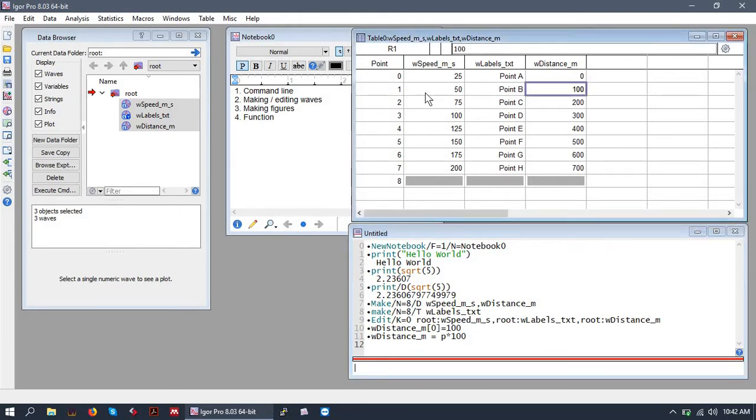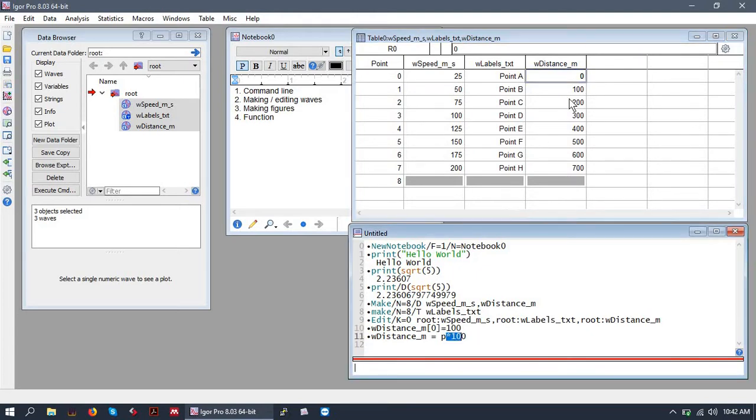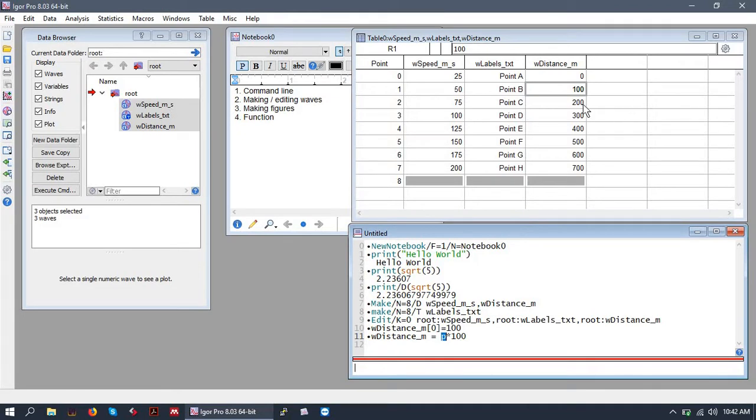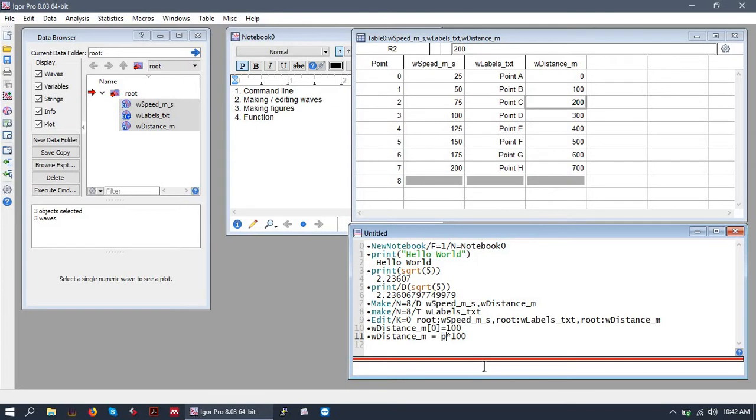So at point zero this wave is zero times 100, P times 100. At point one rather it's simply 100 because point one times 100 and so on. So this incrementing index is very useful when generating big waves that have a standard increment or something like that.